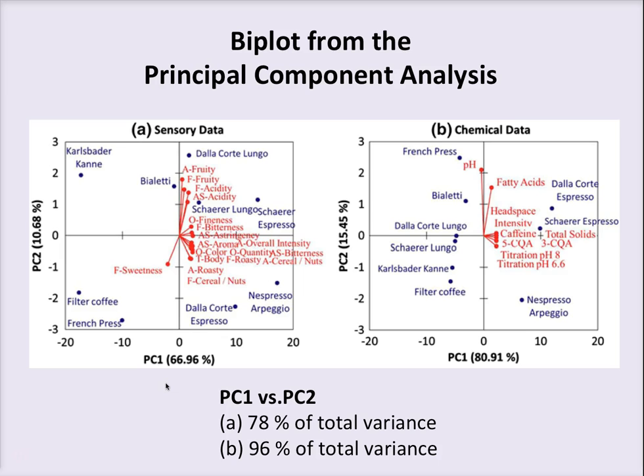You would expect that to some degree, because you're looking at human fallibility, a panel of professional trained testers, but it's still looking at biological variability, where on an analytical approach you're looking at an instrument that can be validated, its measurement capacity can be validated, meaning that all the elements of measurement can be controlled and the variability accounted for.